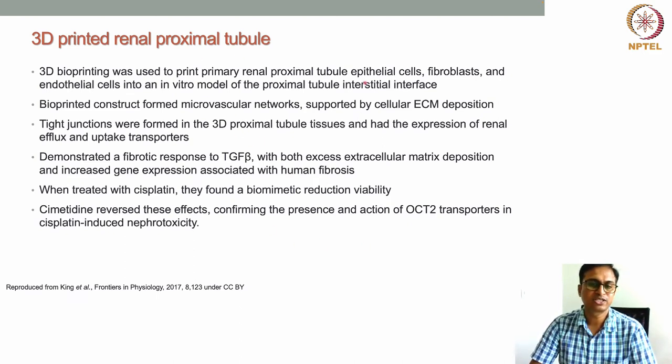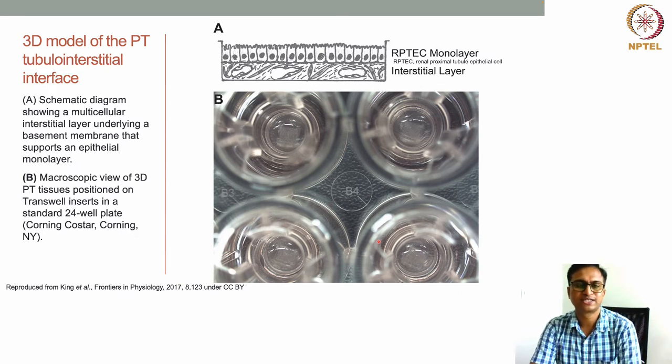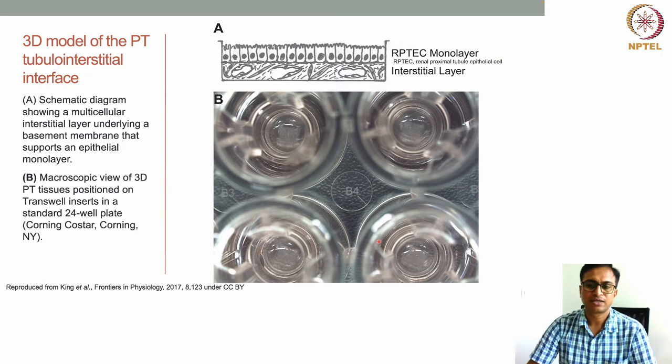So this is another study where 3D bioprinting was used to develop a proximal tubule-interstitial interface. This schematic shows how the RPTEC, the renal proximal tubule epithelial cells, were printed on top of the interstitial layer, where the endothelial cells create vascular structures right within the interstitial space layer.